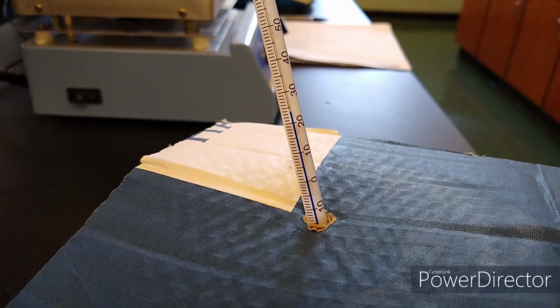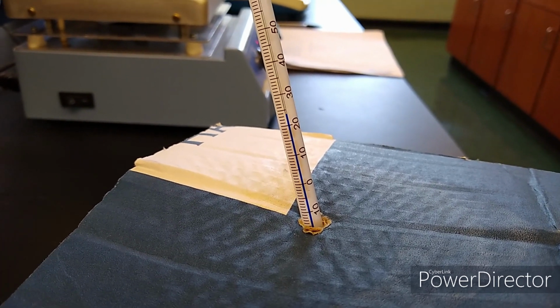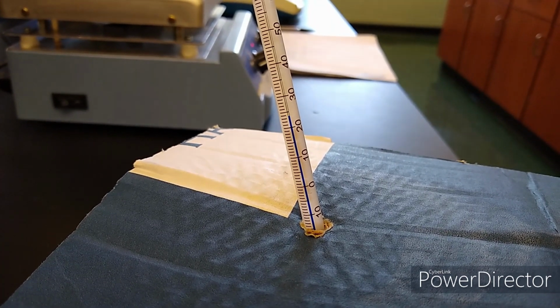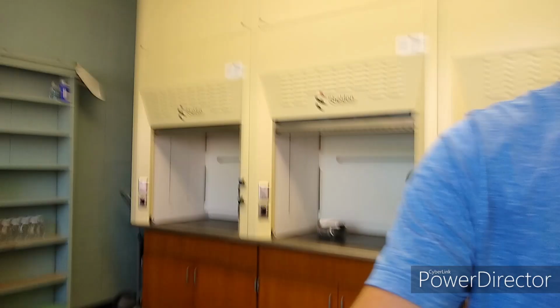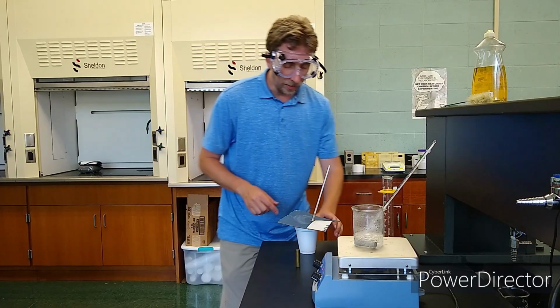Okay, there's the scale, 20. Whoa, it's hard to hold steady. That last significant figure is an estimate in between the smallest marks. 23.6 is what I'm going to say. Okay, 23.6. That's the initial temperature of the water inside the calorimeter.